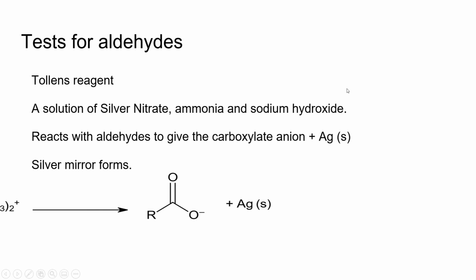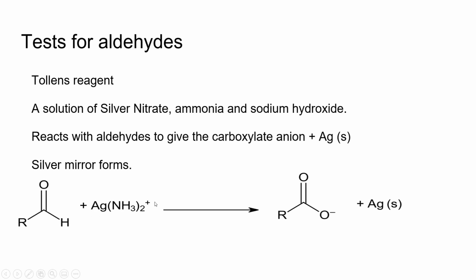So here is the reaction scheme. You can see this is the reduction of this silver complex down to silver solid, and the oxidation of the aldehyde up to the carboxylic acid.